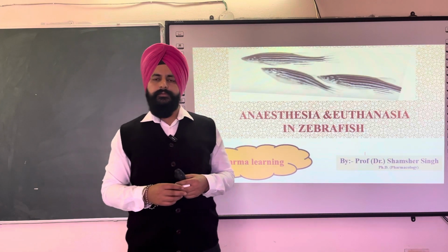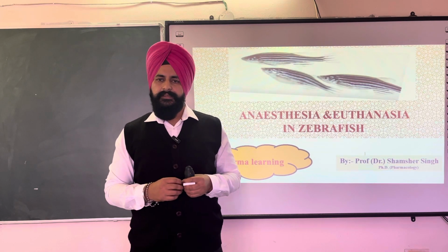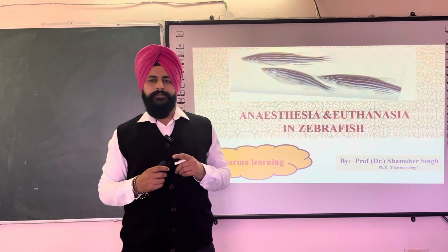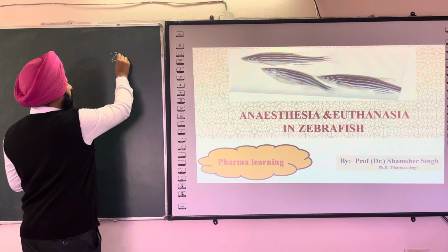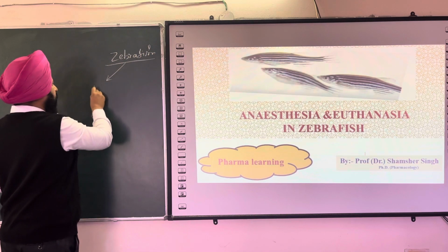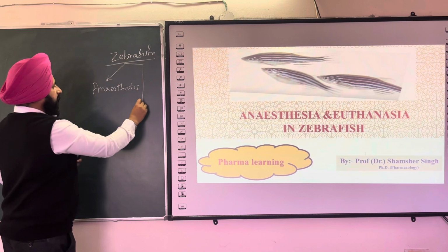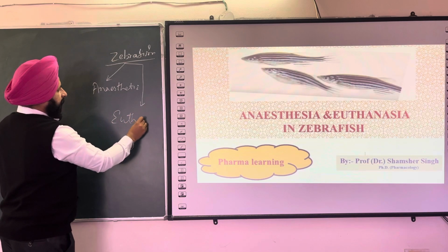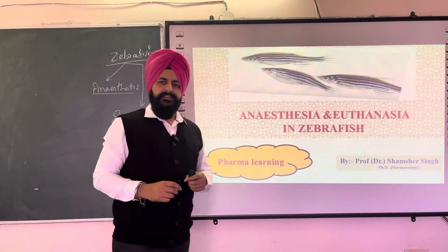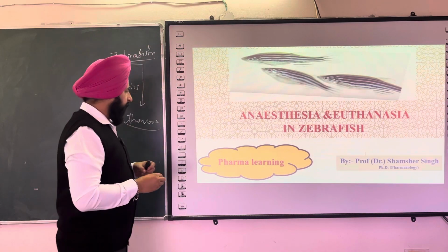Today I will discuss with you an important topic, that is anesthesia and euthanasia in case of zebrafish. That means if you are using zebrafish during experimental work, which type of anesthetic you can prefer and which type of euthanasia techniques you can prefer.